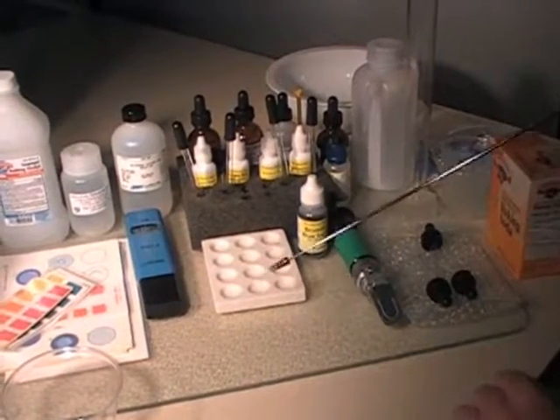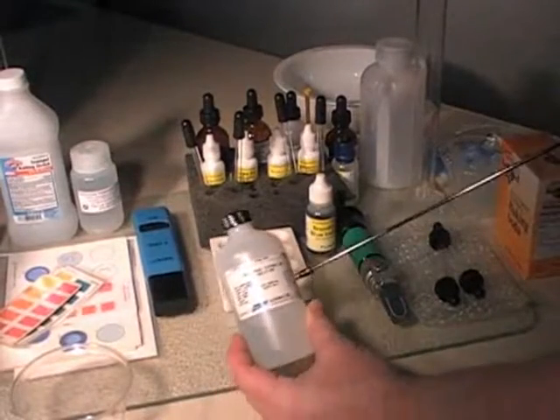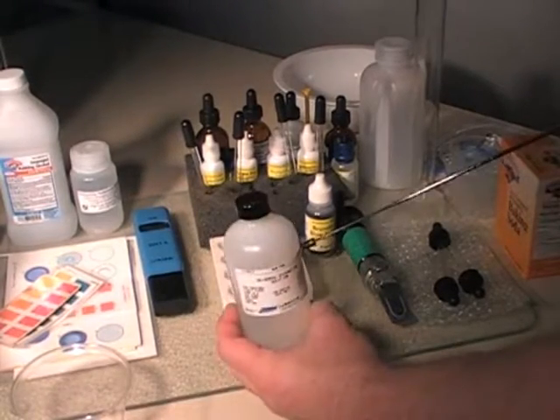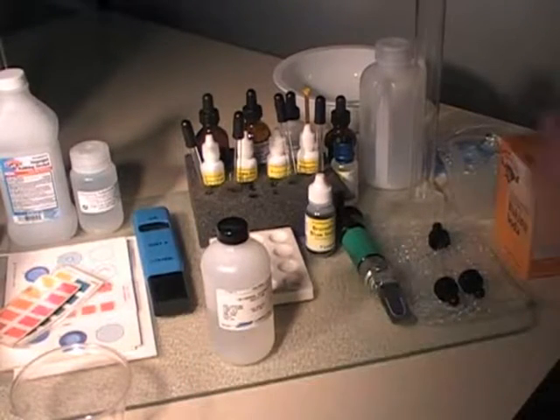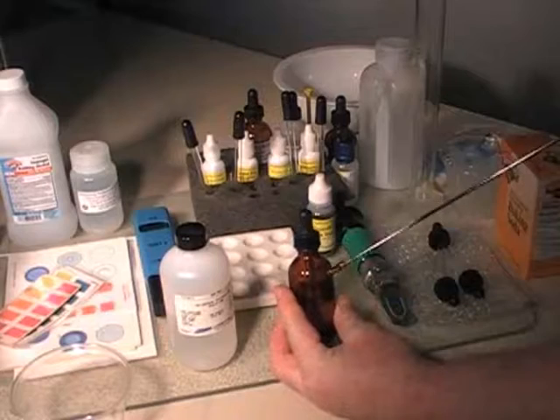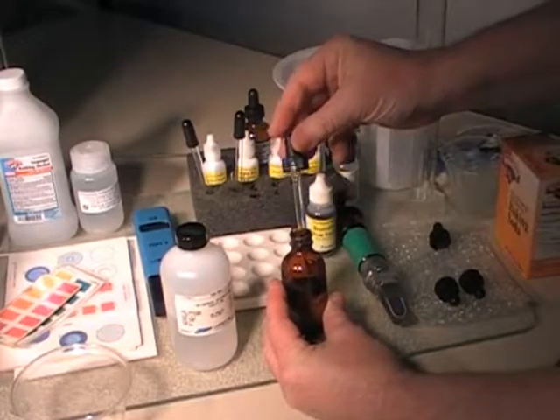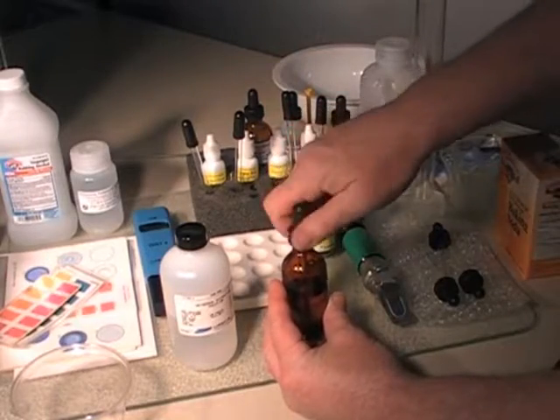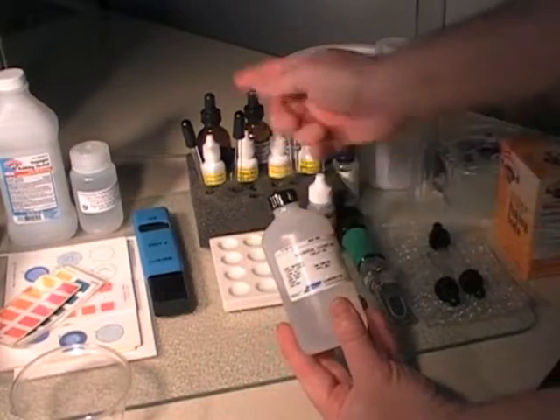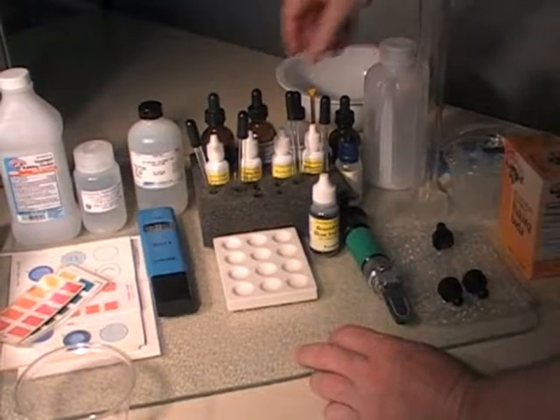The next item in the UPH3 kit is the universal extracting solution, which is needed to extract the nitrogen out of the urine. You get a large 250 milliliter bottle, and you transfer its contents into a smaller working bottle. Into that smaller bottle you insert a glass pipette with a cover, which stays in your foam block until you need to refill it.